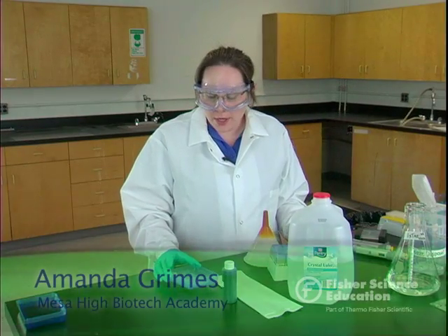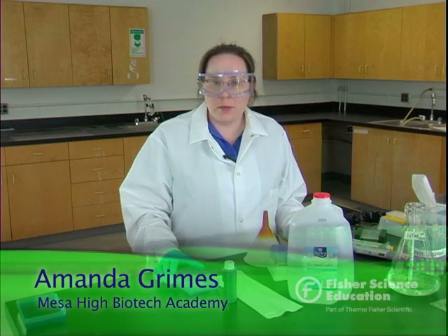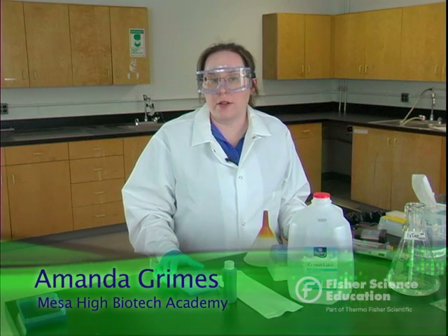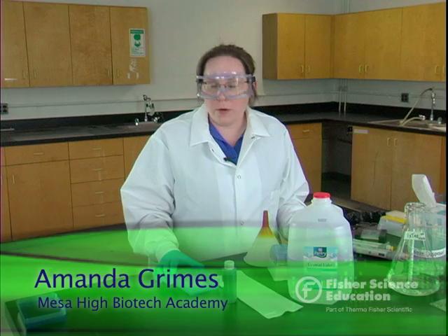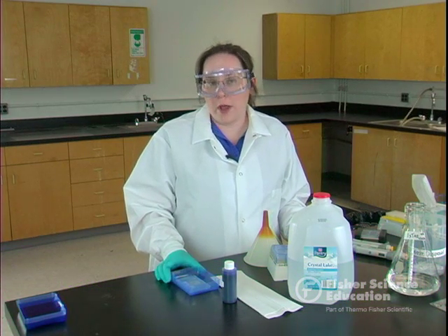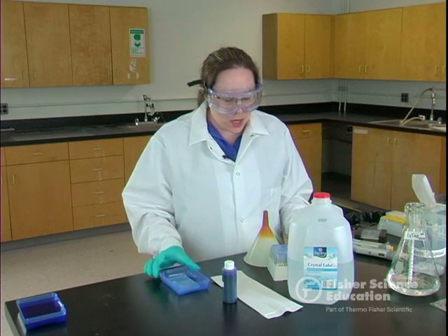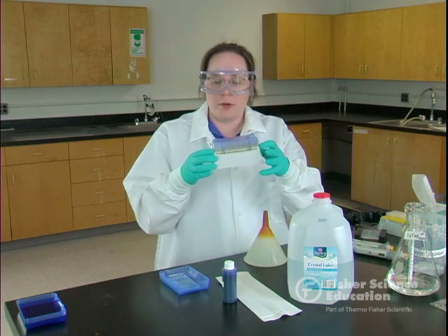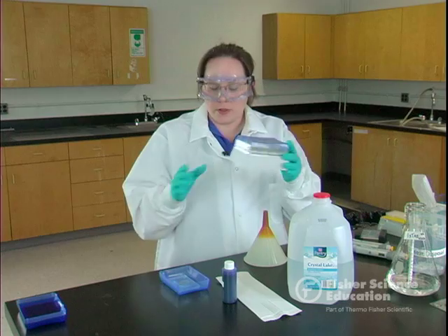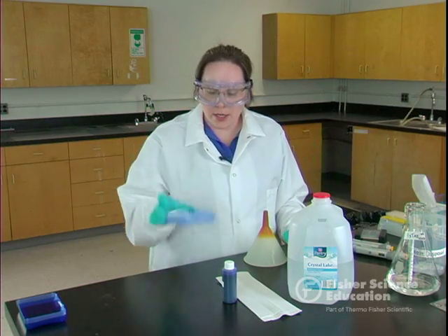I'm going to show you how to stain a gel. This would be similar to if you purchase a dye kit that has to be stained, or if you're using real biological DNA samples. Today we're just staining a gel that was run with dyes. If you don't have weigh boats or staining trays, you can improvise — after some tips are empty, you can just rip off the lid and use that. It's the perfect size little tray to stain a gel in.